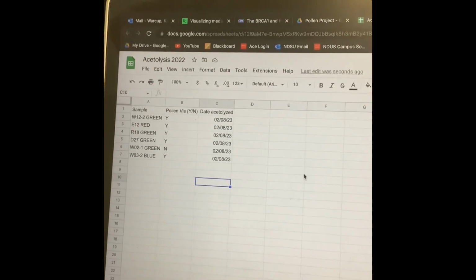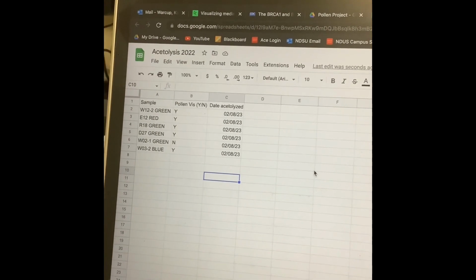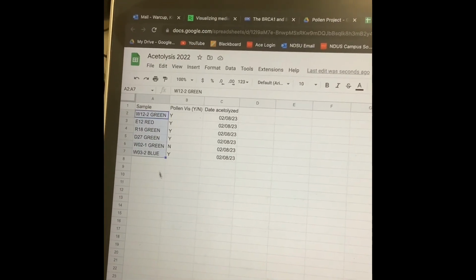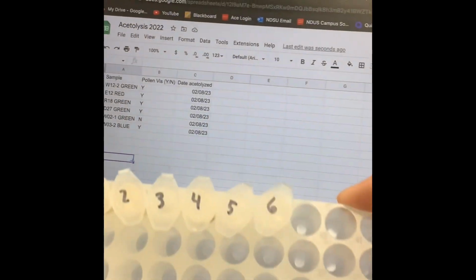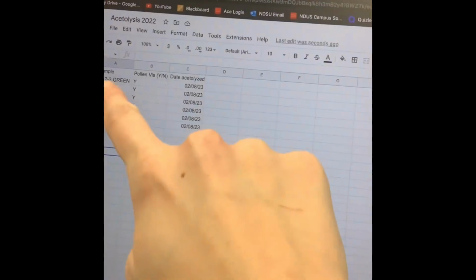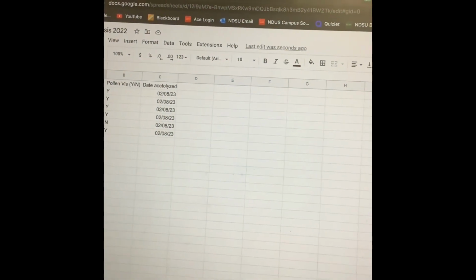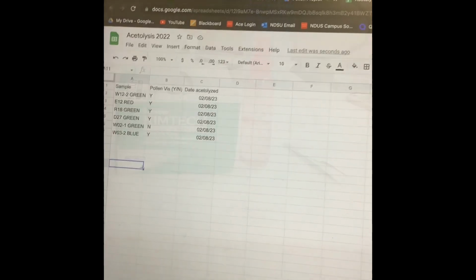So here is all of the sample information entered into the spreadsheet. A few notes about this: make sure you double check that you've written in your sample names correctly, and also double check that you've entered them in the order that you numbered them. So like sample number 1, I know is this W12-2 green, and that's how you're going to keep track through the chemical processing which sample is which.